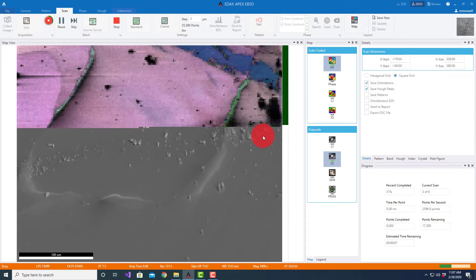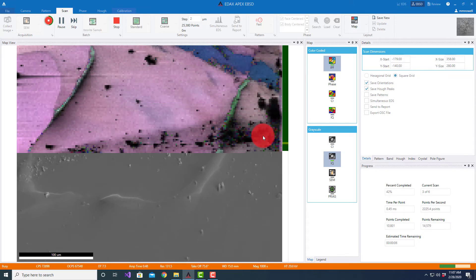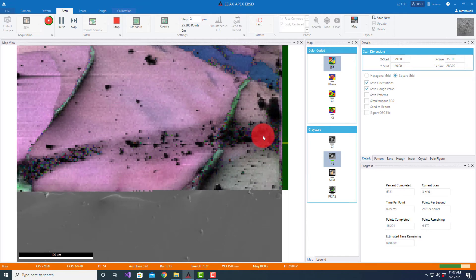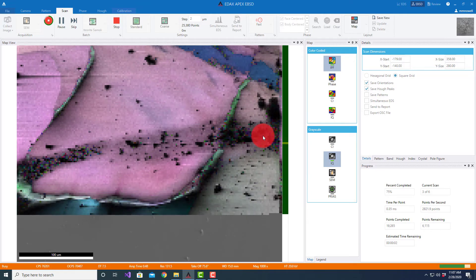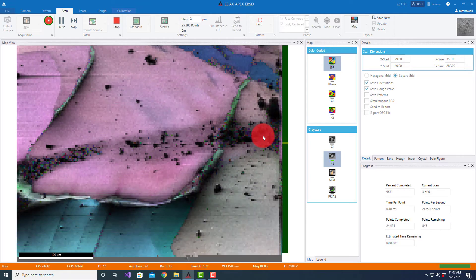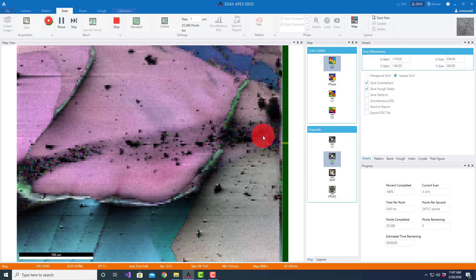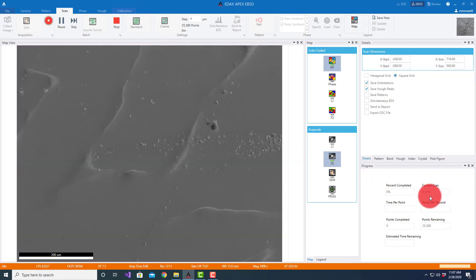We're doing two micron steps and you can see as we look at the progress, it's telling us where we are on the scan list. So we're at number four of six right now.